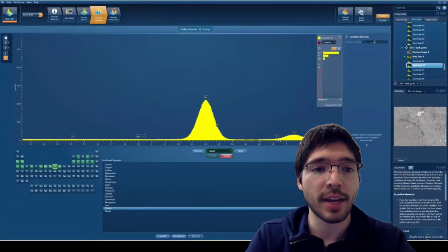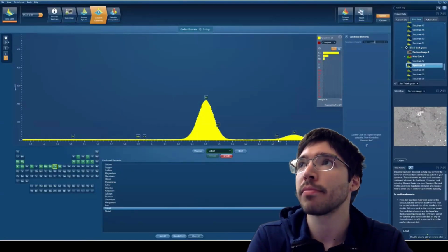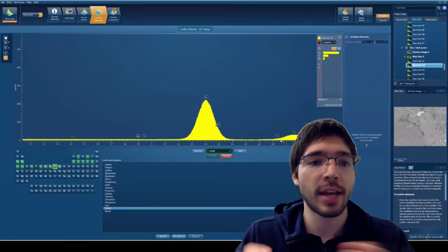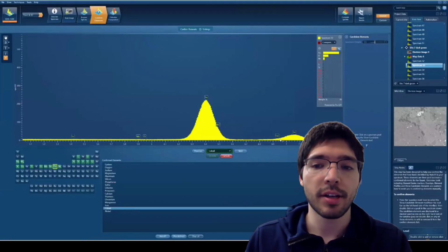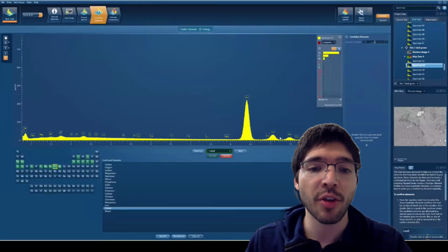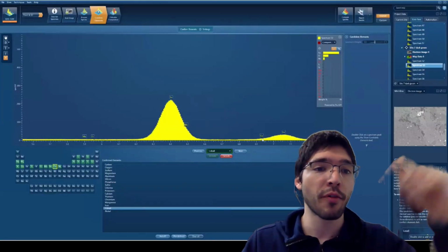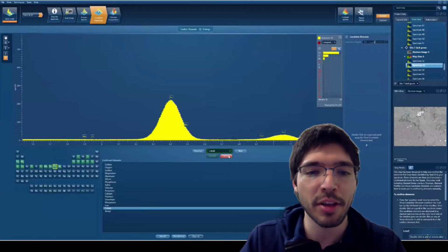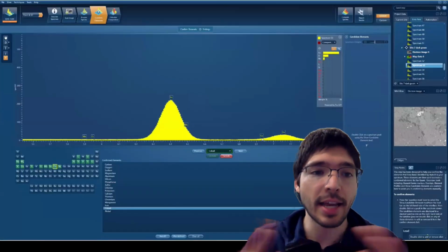That also means that if you're trying to look at things like gallium, germanium, all those important siderophile elements in iron meteorites that people use to classify them into the different iron meteorite groups, we can't do that with this technique either, because they're in such low abundances and there are many overlaps between all their energy peaks that we just can't pick them up. So that's what I'm explaining there: there are limitations to any data collection technique.